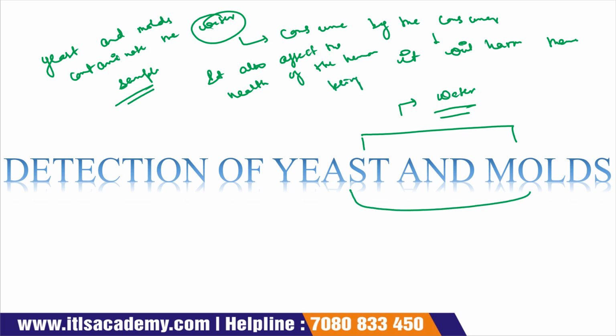Yeast and mold become a reason for food spoilage. So ultimately, the main reason for detecting yeast and mold in a sample is to preserve the health of human beings and of the person who is consuming it. So that's why we are going to discuss how we detect yeast and mold.